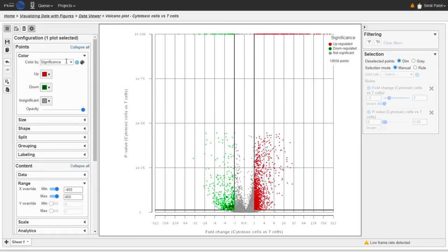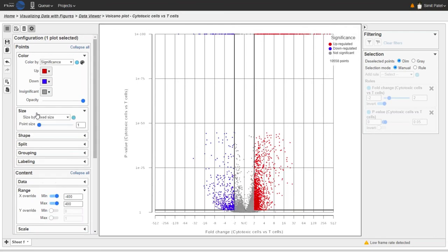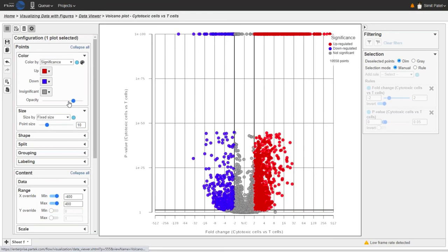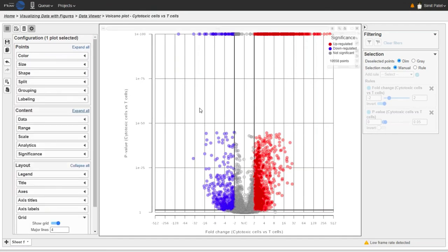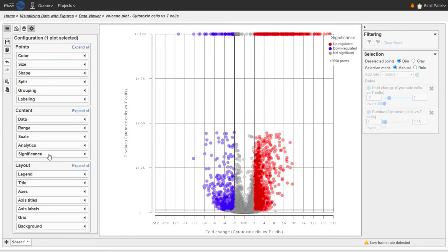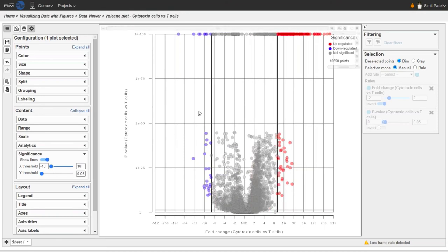We can change the coloring as well — currently they're colored based on significance: red for up-regulated, green for down-regulated, and gray for non-significant. I'm going to change the color for the down-regulated genes to blue. We can also change the size of the dots and the opacity. We can play with the significance settings to see the effect of increasing or decreasing the significance criteria. Opening the Significance card, I'll use a different fold change cutoff — increasing the stringency to plus or minus 10 — and you can see those bold lines have moved to the left and right, still giving quite a few significantly differentially expressed genes.